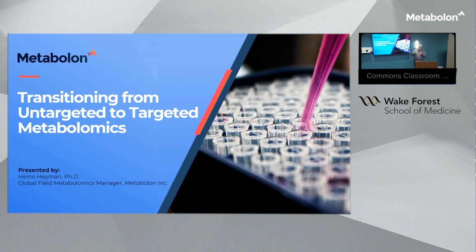And then also, how do you take that data and, to Nicole's example, identify this mystery metabolite being quite important in your data? And if that is a mystery metabolite or if that is a known metabolite, how do we go about going more in a targeted fashion to validate that in a larger cohort and start tracking those metabolites of interest in a given cohort?